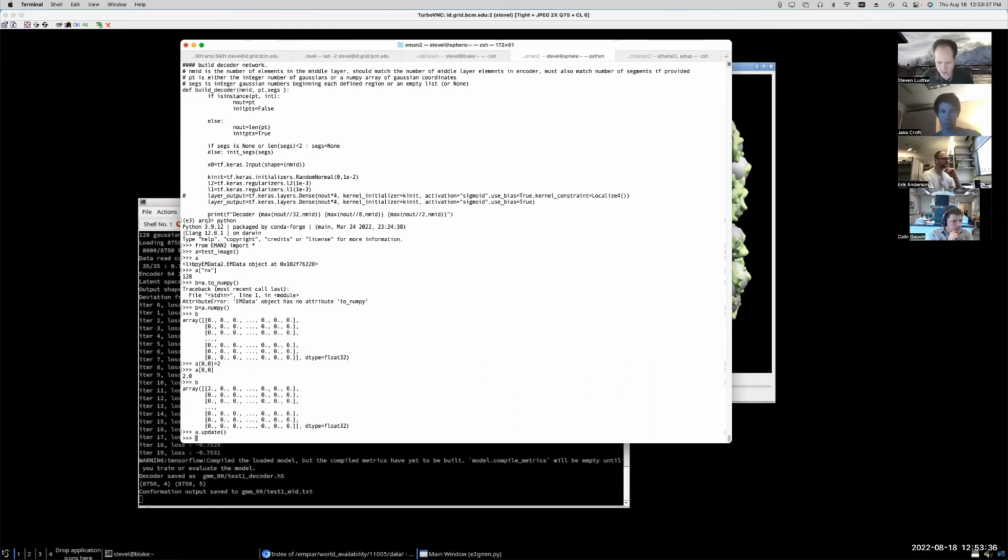Now, once you've produced a NumPy object, creating a TensorFlow array is trivial. You can just say TensorFlow array, the same way you normally convert a NumPy object into a TensorFlow object. Now, you don't have the same sort of memory sharing ability between TensorFlow and NumPy. A lot of the operations you can do in TensorFlow are very similar to the operations you can do in NumPy. There's a lot of commonality between those two ecosystems, but there's a very good reason why you don't have this sort of EMAN to NumPy convenience.